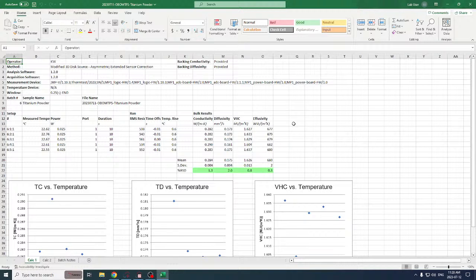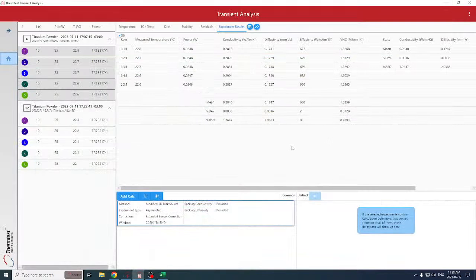I think that concludes this demonstration of testing powders with the MTPS sensor and the symmetric version, or two-sided, both again almost identical for both MP-V and MP1 for testing such materials.